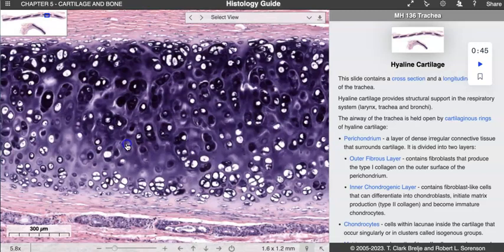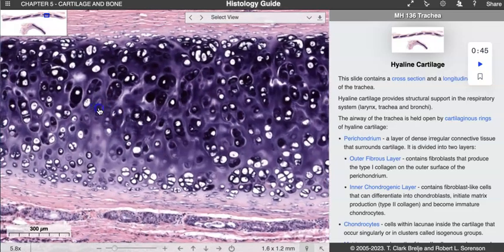Hyaline cartilage is pretty typical in appearance of what we're seeing here. It really does look like this, even when we head over to, let's say, the epiphysis of a long bone, and you have that articular cartilage that is there. It's very similar in appearance to what we see here. All right, so nice, lovely, kind of uniform chondrocytes, so they're really nicely evenly distributed.